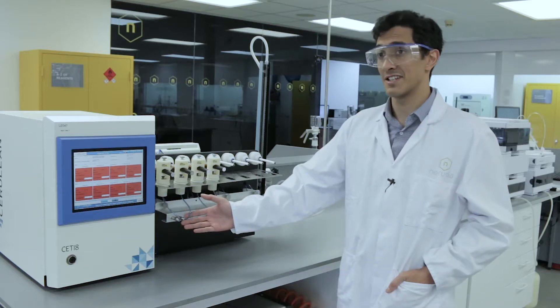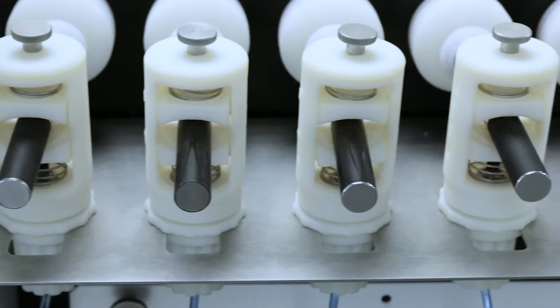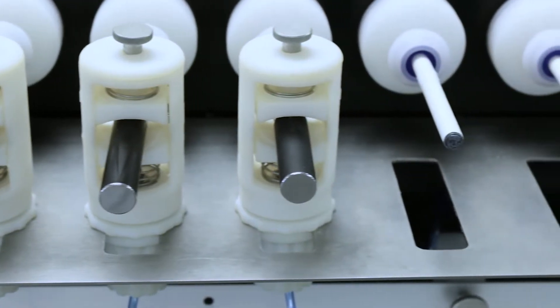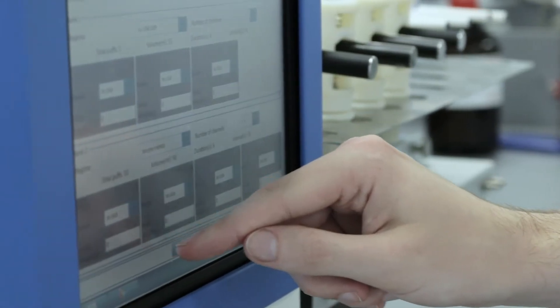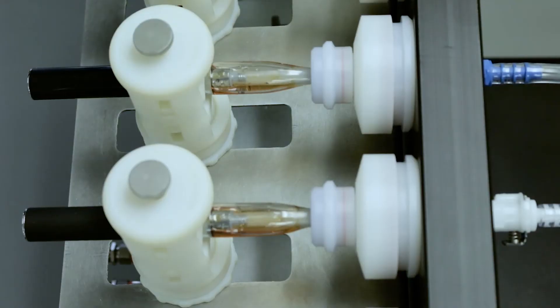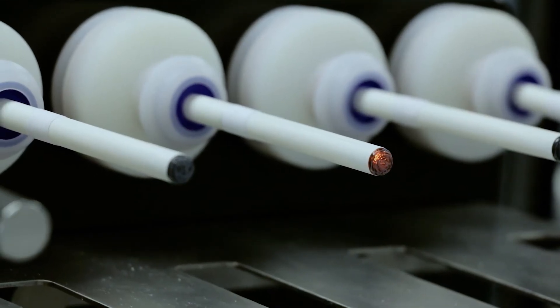Here is our e-cigarette testing instruments. With this machine we can capture the aerosols from e-cigarettes. We either capture them onto fibre filters in the case of nicotine emissions or onto DNPH cartridges to capture any of the carbonyls, the potentially harmful emissions.